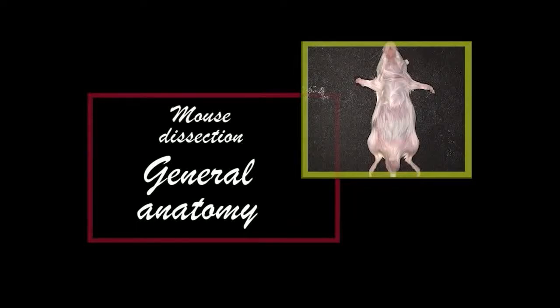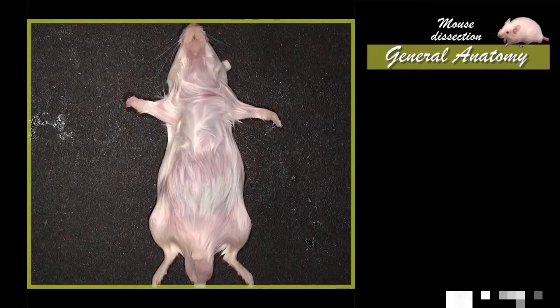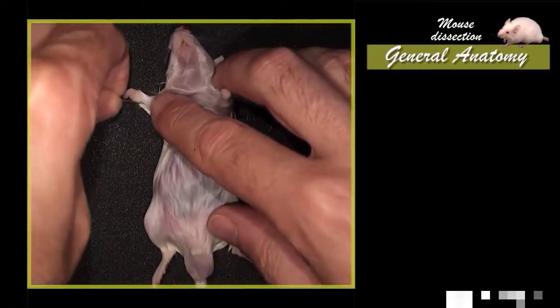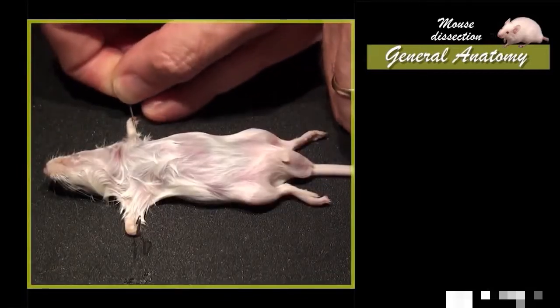In order to observe the organs in place, the mouse has to be laid down on its back. Then, stretch the limbs perpendicularly to the body axis and fix them with pins in the hands and feet.